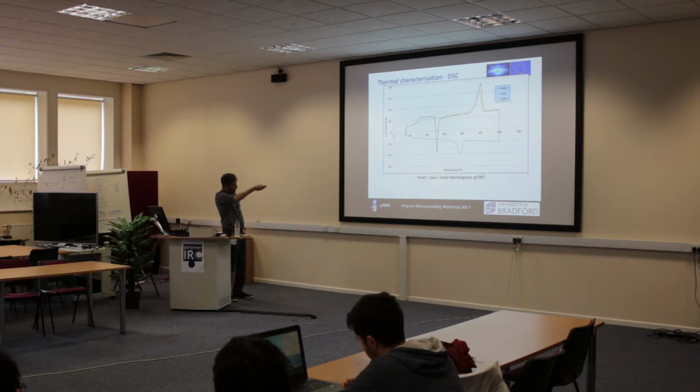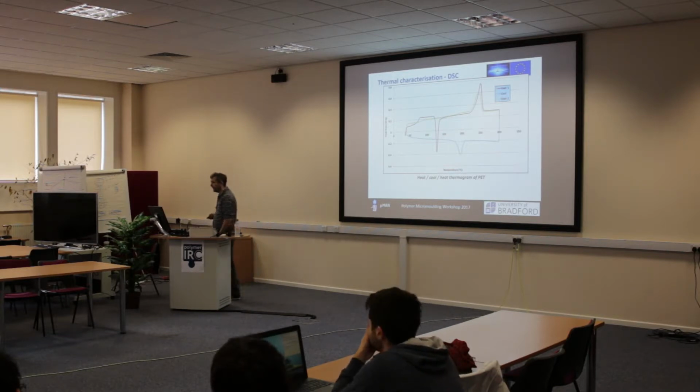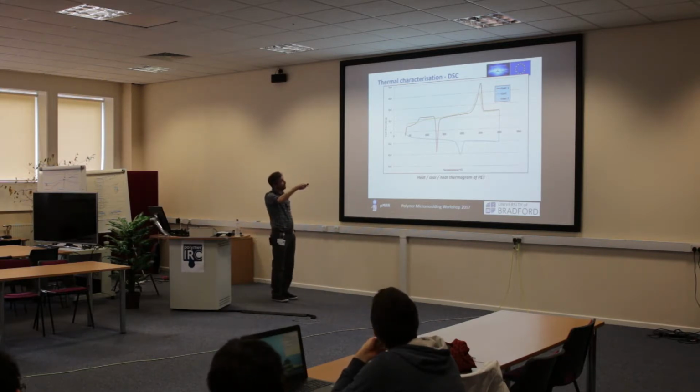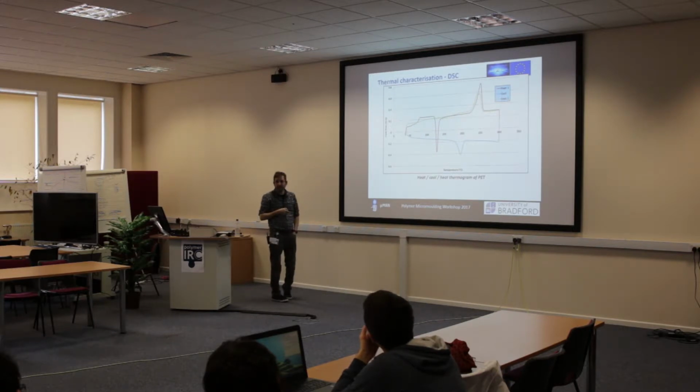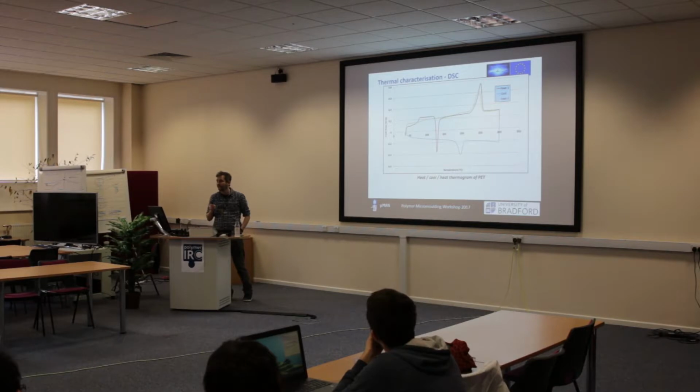So we have that complication, and we've got to melt, and then we come around and recrystallize. So what we've done in this case as well is to heat it up again, and you'll see when we heat it up again, we don't end up with this solid state recrystallization, but what we end up with is a double peak on the top of this temperature curve here, okay? Again, associated with two different crystal forms appearing within our material.